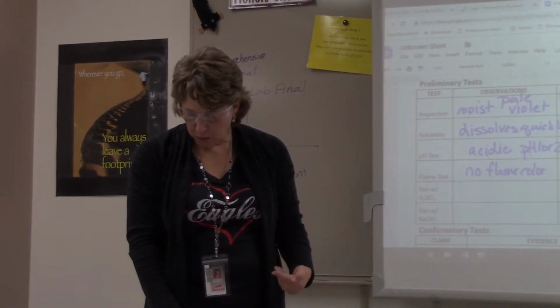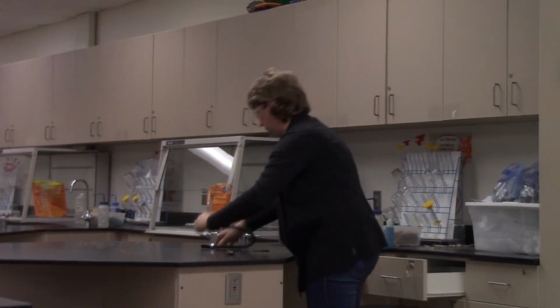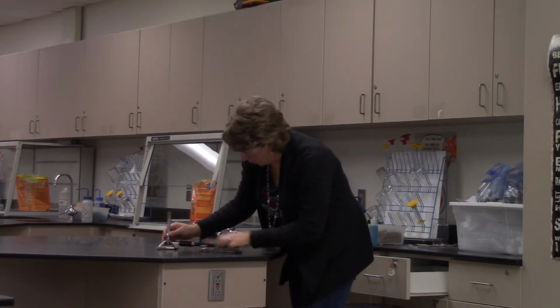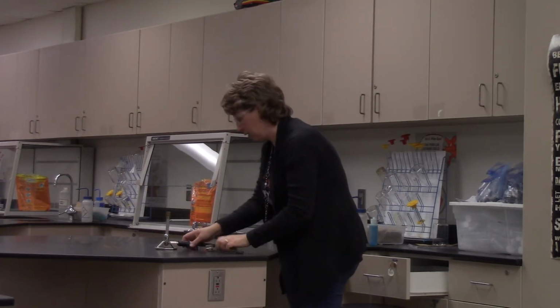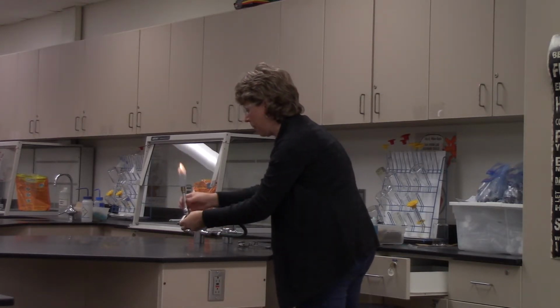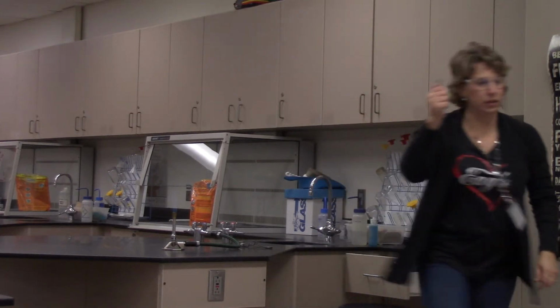And then at that point, I'm also going to go ahead and heat that up. So I'm going to get a Bunsen burner. Okay, I'm going to use my handy dandy test tube clamp.